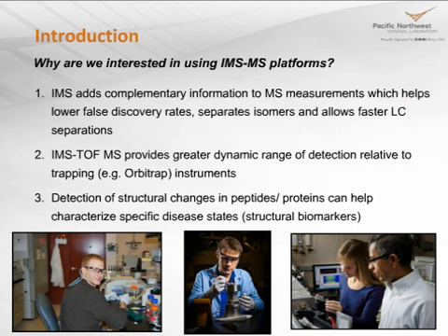Our third interest is that we're interested in detecting structural changes in peptides and proteins that could help characterize specific disease states or maybe be determined as structural biomarkers.